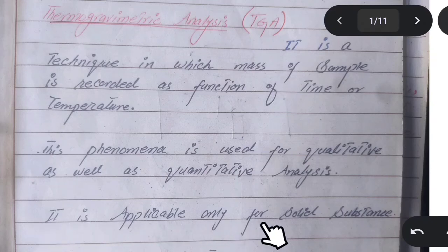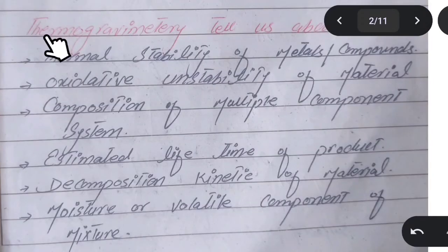Thermogravimetric analysis is only applicable for a solid substance. Let's say, for example, we can perform thermogravimetric analysis only for solid substances. We cannot perform it for liquids, gases, plasma, a Bose-Einstein condensate, or any other state of matter. We only have to perform it on a solid state.